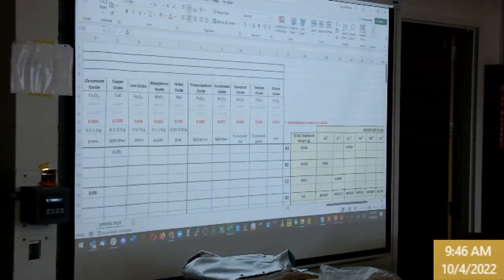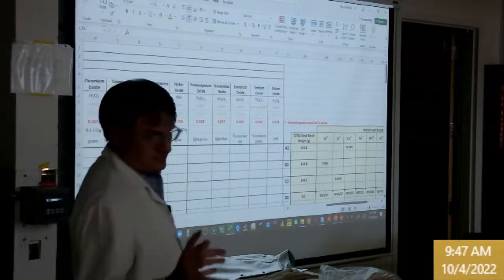And I don't know if I need to clean this thing out, but my piezo is not working here. This is a piezoelectric fire starter spark. Nothing lasts these days. So, torch.